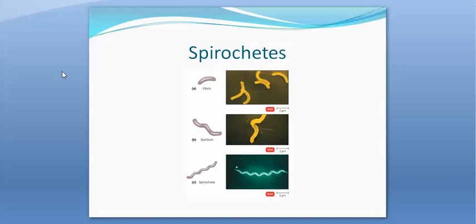This slide shows the other main group known as spirochetes. The top slide actually shows what's known as a vibrio, which is not classified as a spiral shape itself. It pretty much falls into its own classification for morphology and its characteristics of what we know as vibrio. Vibrio is part of the Vibrio cholera types of bacteria, so we'll leave it at that.